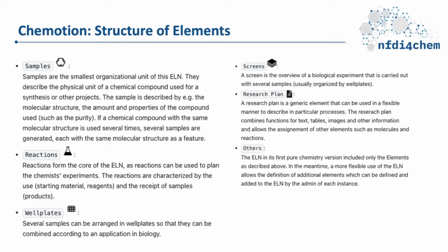And then you have the research plan, which is a summary of all the experiments that you are performing within Chemotion. And recently there have been efforts in order to make Chemotion more generic rather than specific towards certain domains. And one of the outcomes of the efforts was being able to create generic elements within Chemotion, which I'll get into the details of in a second.